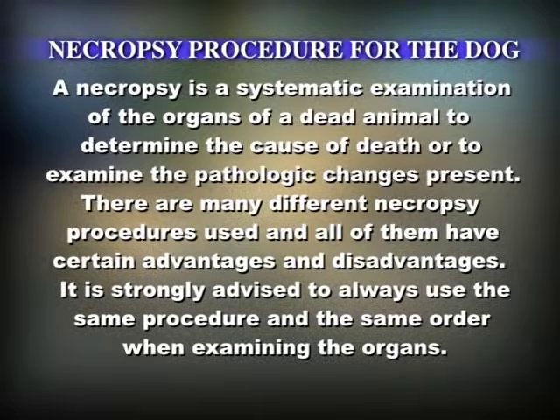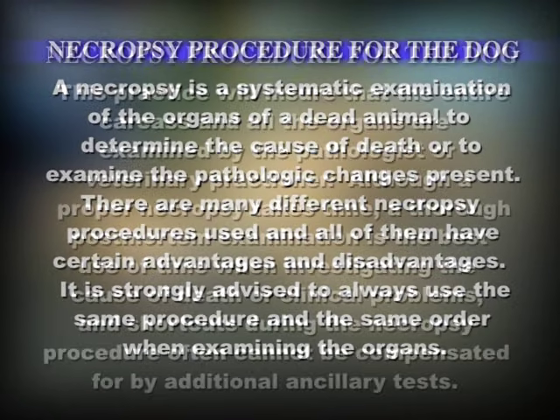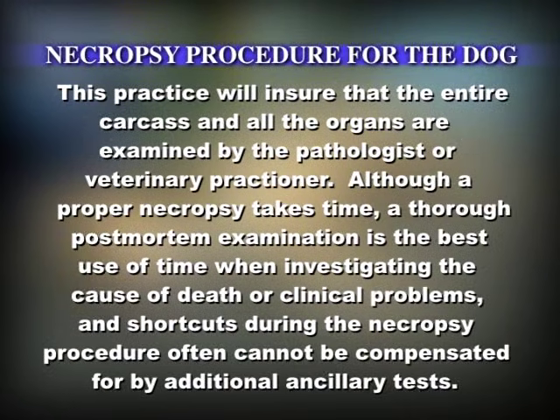A necropsy is a systematic examination of the organs of a dead animal to determine the cause of death or to examine the pathologic changes present. There are many different necropsy procedures used, and all of them have certain advantages and disadvantages. It is strongly advised to always use the same procedure and the same order when examining the organs. This practice will ensure that the entire carcass and all organs are examined by the pathologist or veterinary practitioner.